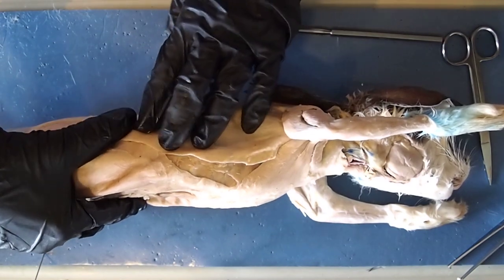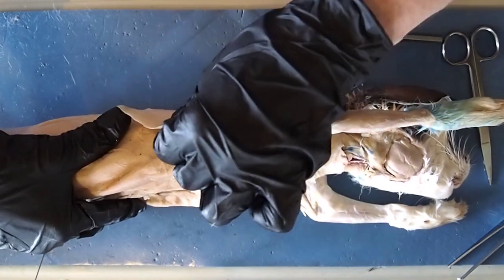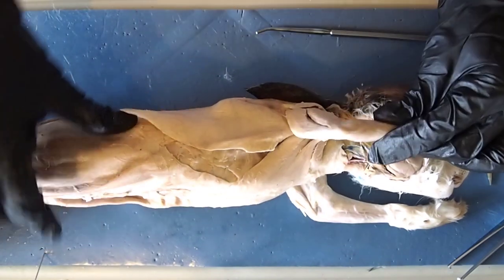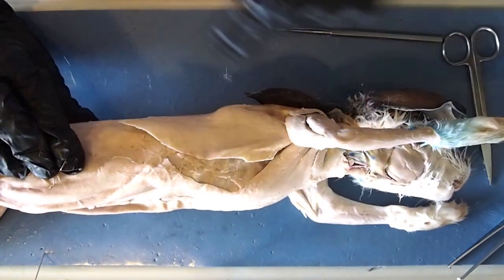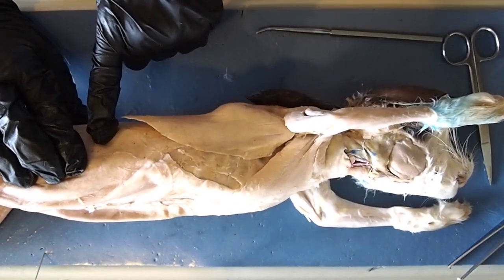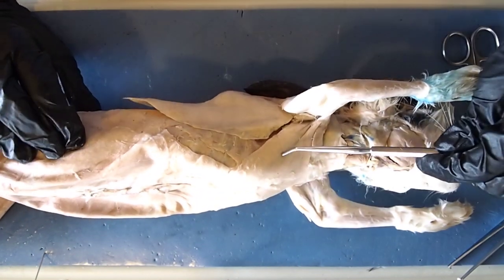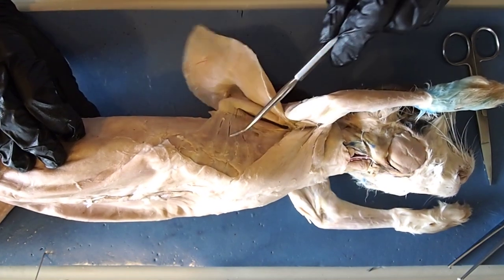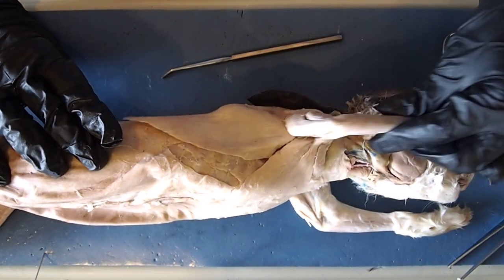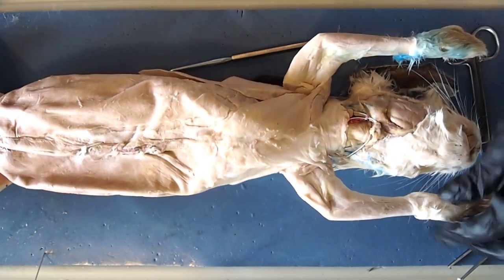Covering the serratus ventralis is this very large muscle right here. As I pull it back, it almost looks like a Superman cape — this muscle is called the latissimus dorsi. It runs all the way up under your armpit and all the way down to almost where your abdomen is. Like the pectoralis and the serratus ventralis, the latissimus dorsi is also involved in the movement of your shoulder.